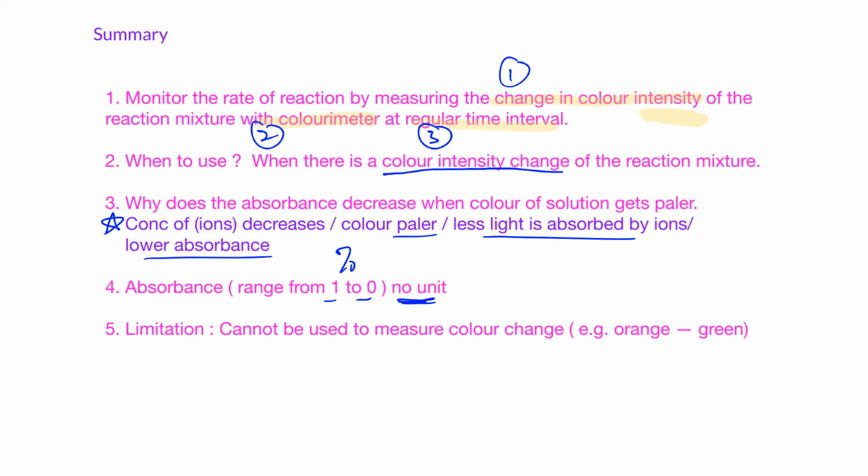The limitation is that we cannot measure a color change. If you have a reaction that changes from orange to green, sorry, this method is not suitable to use.